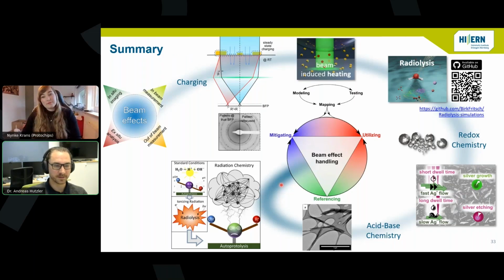But yeah, sure. So in a liquid cell with micrometer thick liquid layers, you probably don't get any sufficient signal from EELS. When I showed these parallel beam electron diffraction measurements, there we had a very similar problem, maybe not as severe, but for roughly a micrometer thick liquid layer, you even lose the zero beam, so you don't need to use a beam stopper anymore to do diffraction, actually. Yeah, that is a really good point.